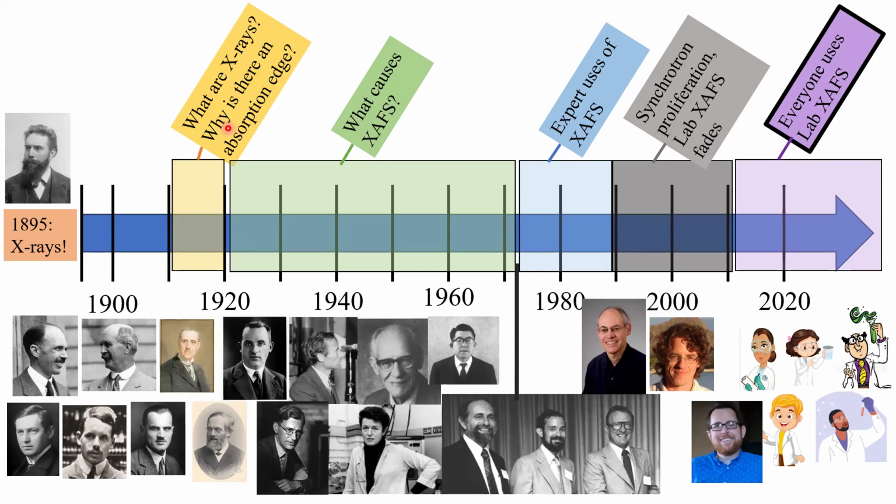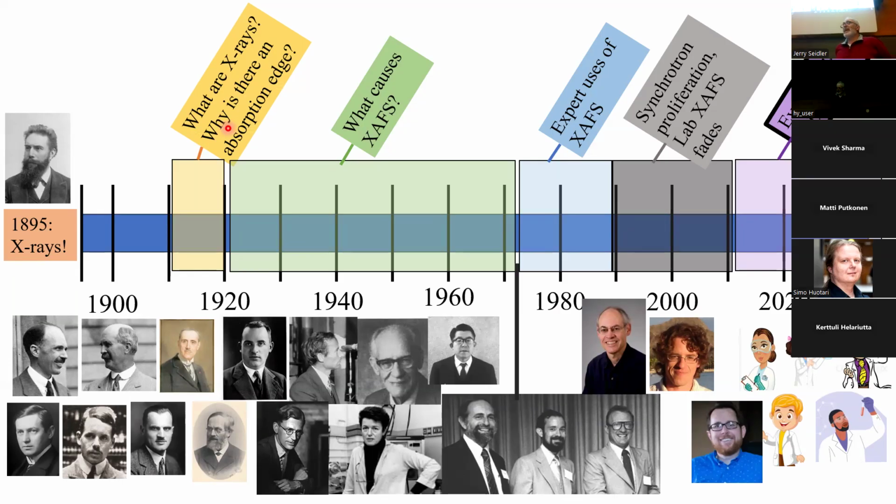Well, the non-radiative transitions will be Auger processes, which is where the energy entirely comes out in electron cascades. And the branching ratio itself was a topic of extensive study and calculation for a long time. As a rough rule of thumb for the 3D transition metals, the K-shell fluorescence yield is about 1/3, and it becomes less as Z goes down and much larger as Z goes up. It's above 50%, but I don't remember exactly where for uranium K-shell, for example.